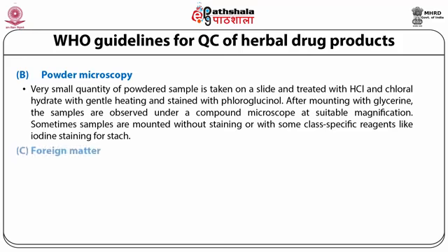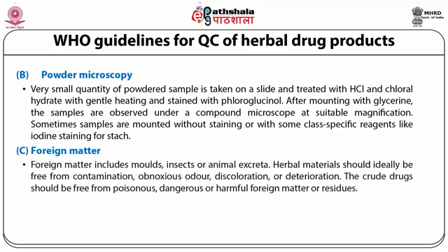Next is foreign matter evaluation. Herbal drugs usually contain foreign matter in the form of molds, insects, animal excreta, or even plant parts from the same plant which don't constitute the drug, or from other plants.